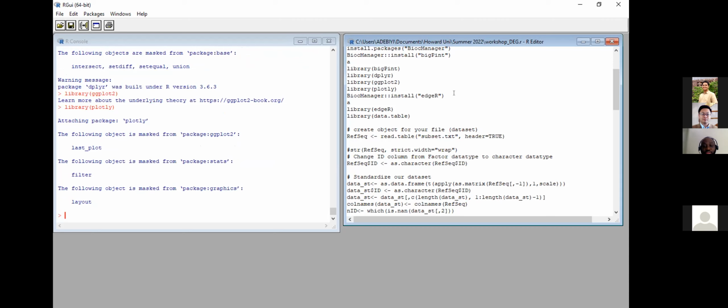I think someone just wrote something. Yes. So yeah, you can just do Control R. So doing that, just yeah.